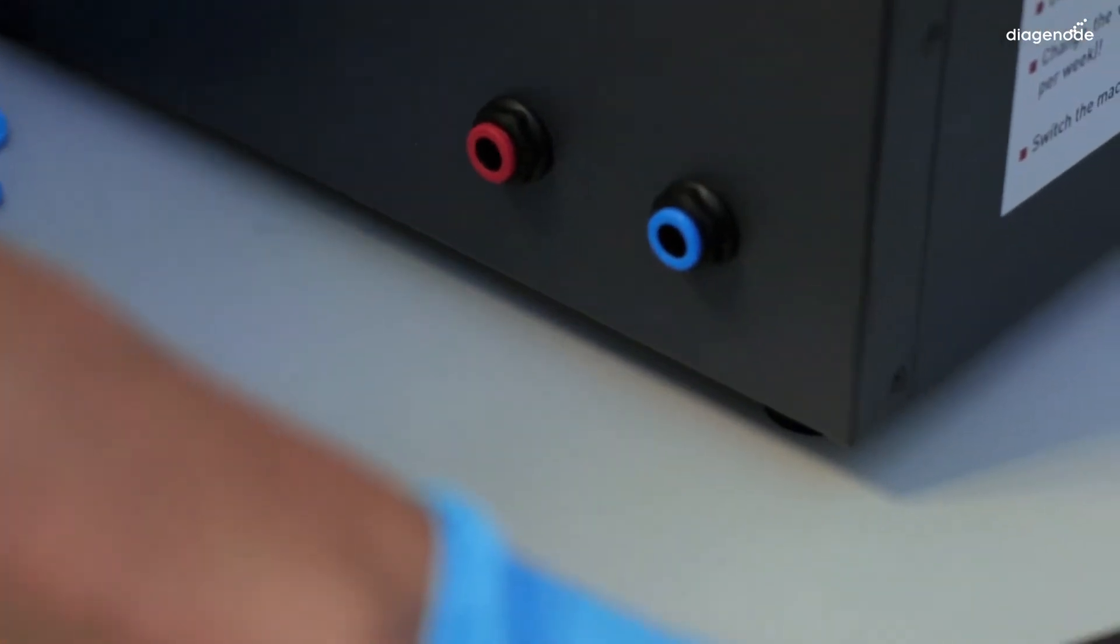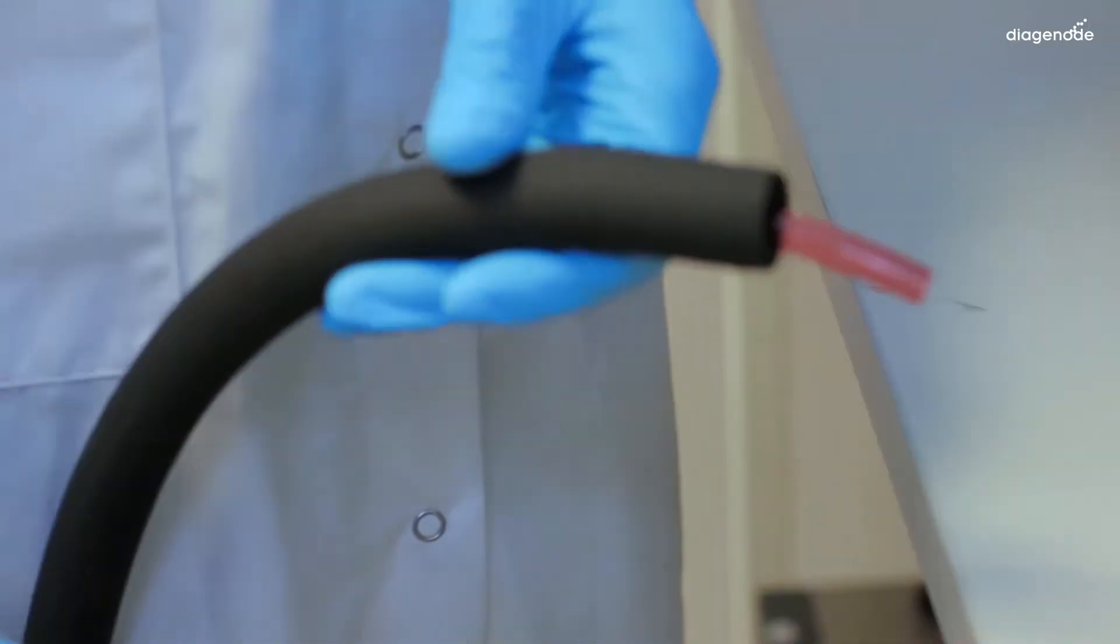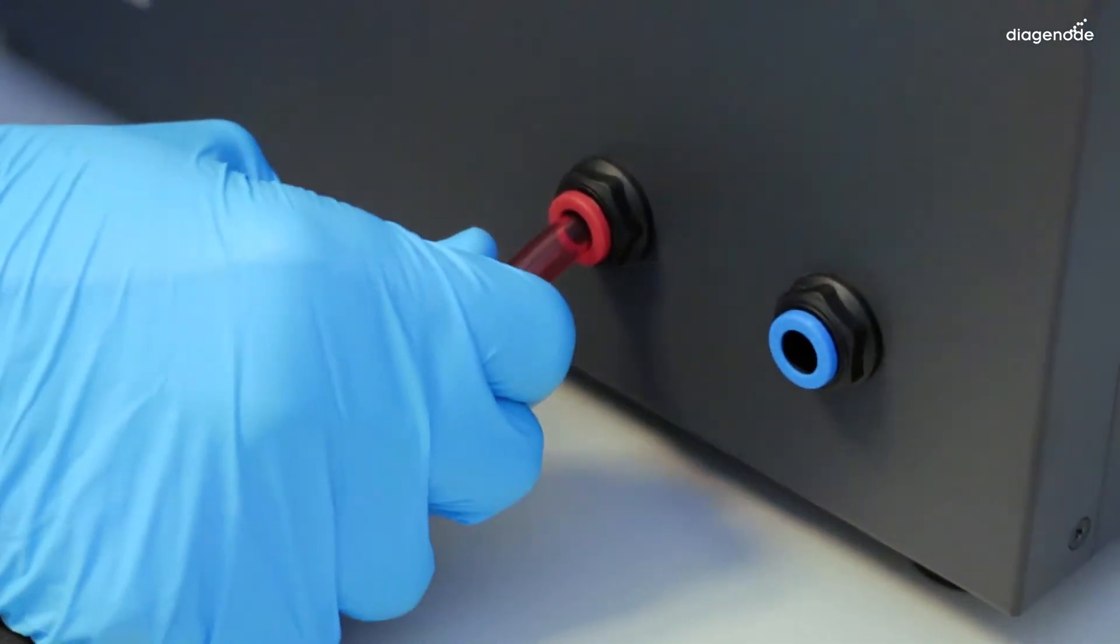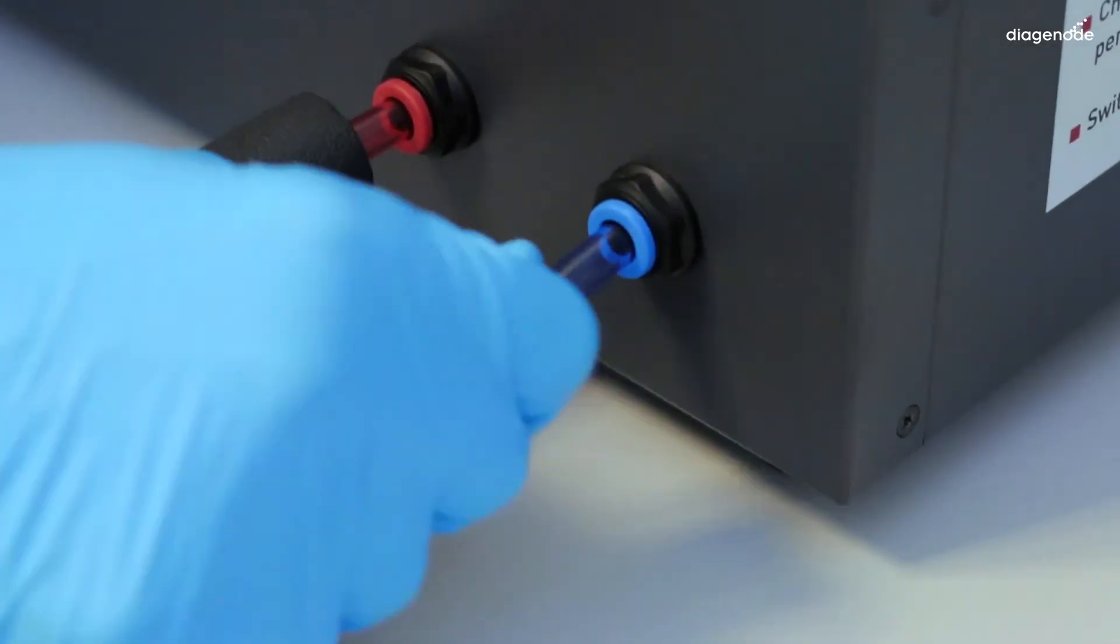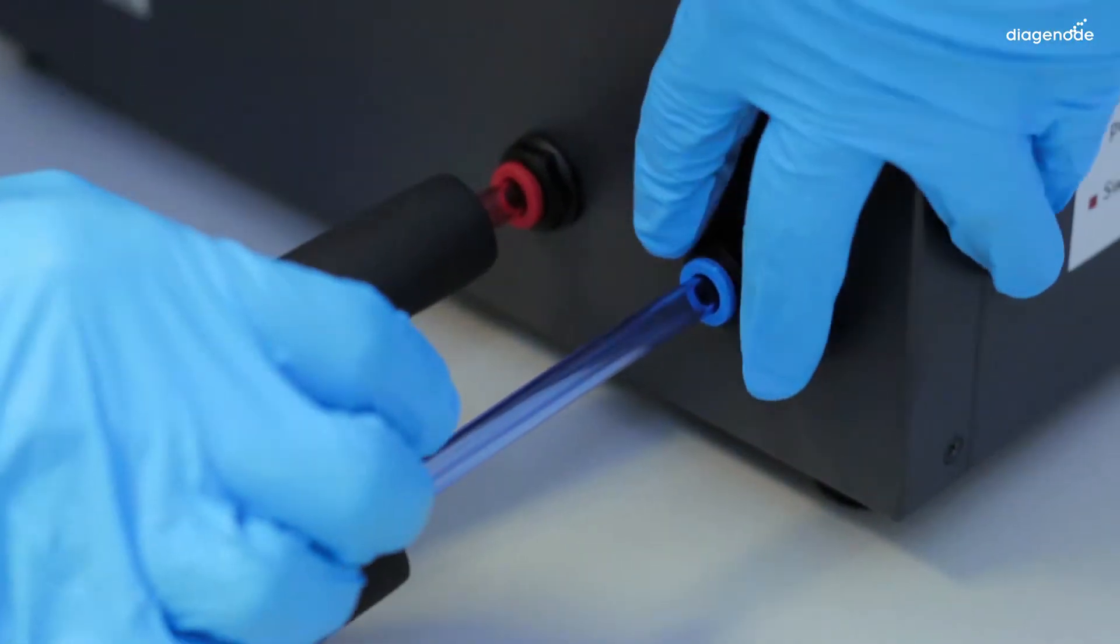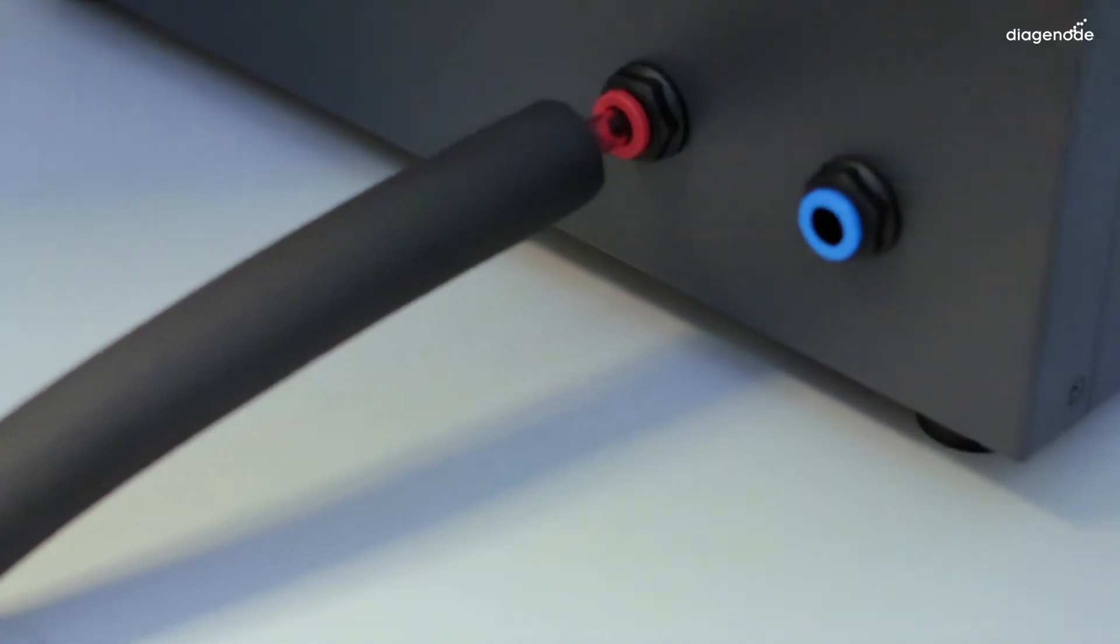We will now connect the BioRuptor with the cooler. Insert the cooling long red and blue isolated tubing by inserting them into the connectors. To check if they are well plugged, try to take them out. Indeed, it's well plugged. If you really want to take them out, just push the ring while taking it out.